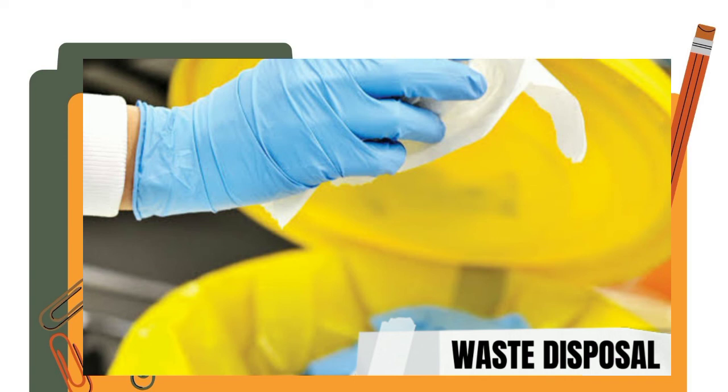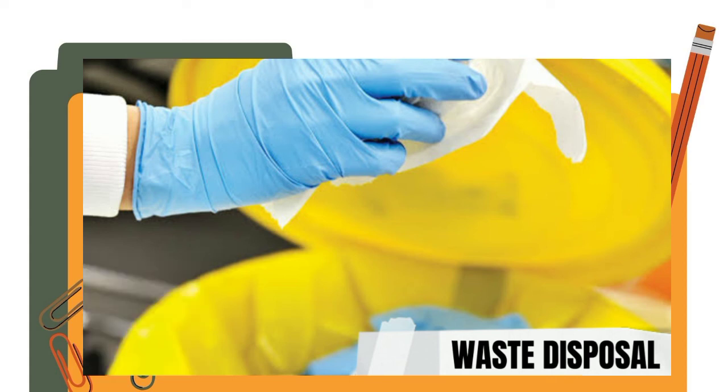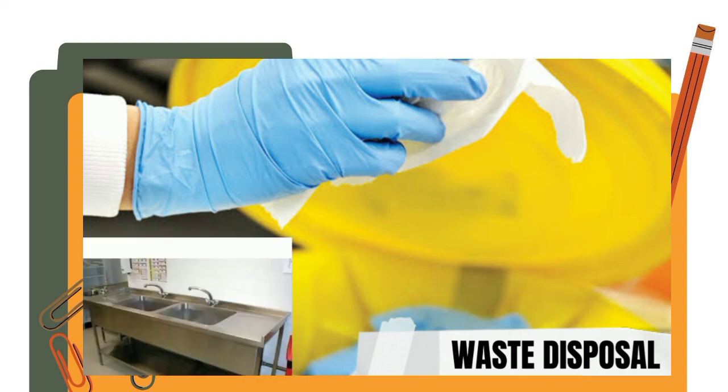So, the first step na kailangan natin gawin for disposal is to collect the sodium hydroxide rinsings into a beaker and then dilute with plenty of water and then flush directly down the sink with copious running water. Second, dilute all diluted solutions with plenty of water and then flush directly down the sink with copious running water.